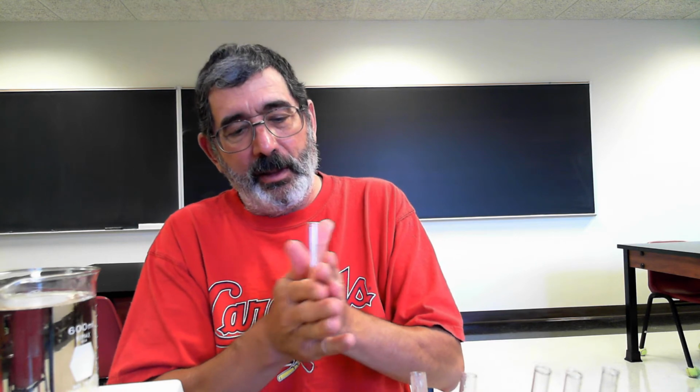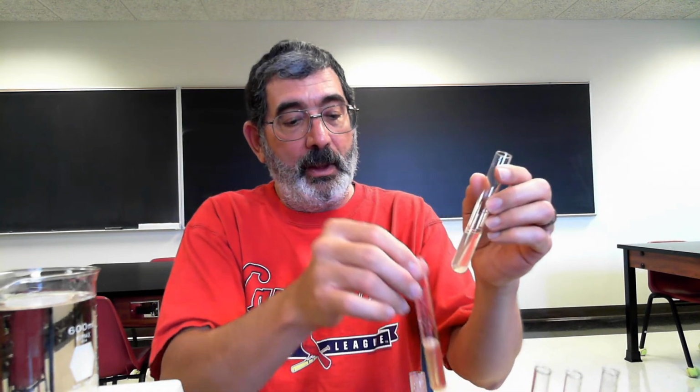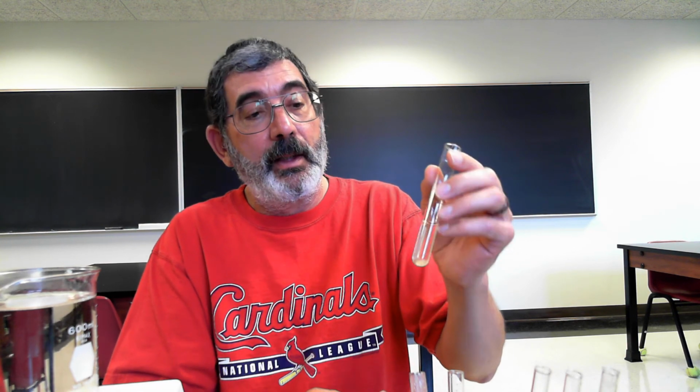Now the cold one, initially we saw maybe just the slightest tinge of brown. And I've been holding it in my hot little hands here, trying to gently warm it up. And if you'll notice now, we're getting more brown color. Hasn't quite caught up to the room temperature one, but obviously starting to get some brown color. So did the cold temperature denature our enzyme? No, it didn't. What the cold temperature did is slow down the rate of our reaction. And now that it's starting to warm up, our enzyme's functioning fine, and we're getting product.